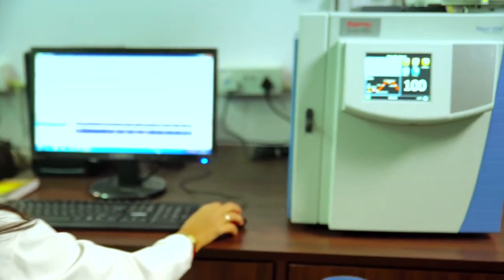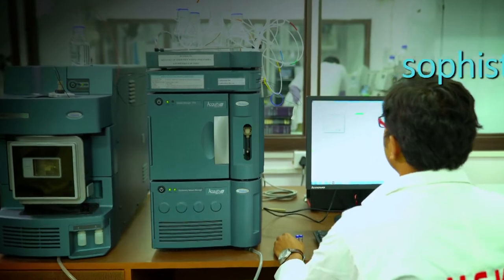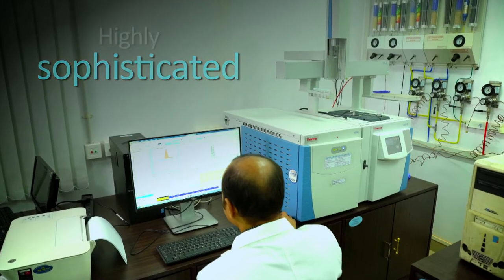MSK's food testing is an integrated facility in India with the most modern technology and highly sophisticated testing equipment.